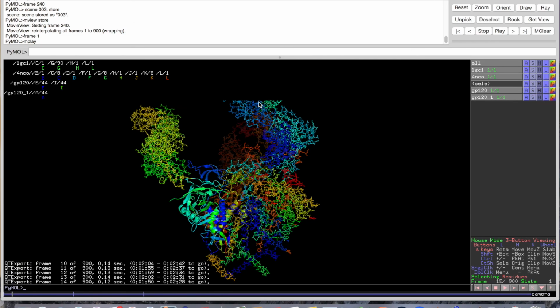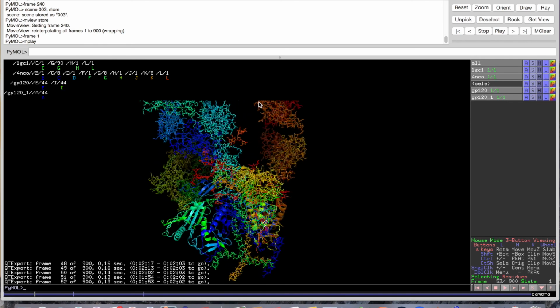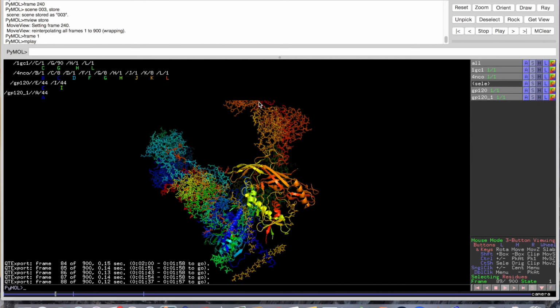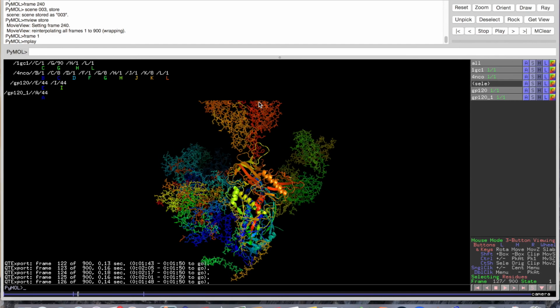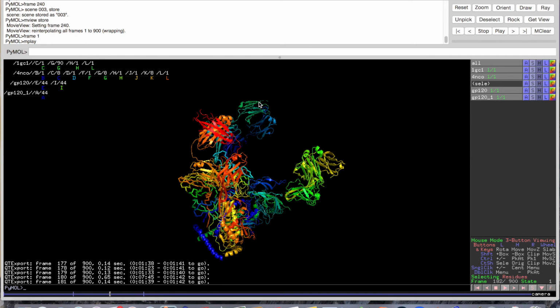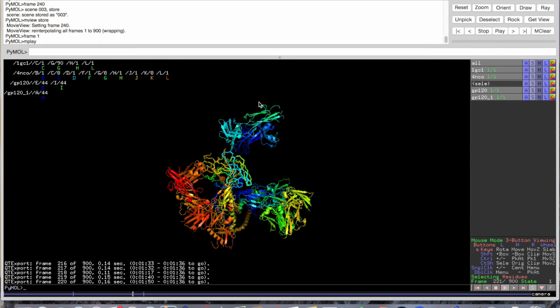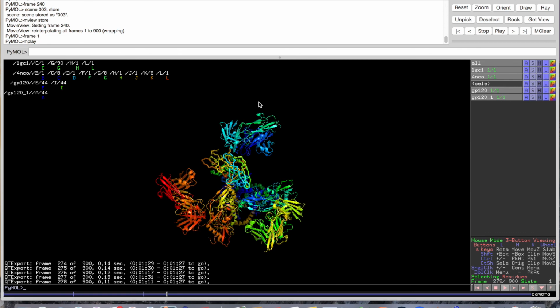So after you save this as a QuickTime file or an MPEG, you're going to want to string a bunch of them together. So you could drop it into iMovie, drop it into any movie editing program you want. And if you have, let's say, 5 different QuickTime files, each with 5 different scenes, then you could just string them all together, play them at whatever speed you want to, add an audio or do something cool. So that's what I advise you to do, instead of make one QuickTime file that's 25 scenes long, because that's going to crash your computer for sure. So especially if you have a bunch of objects.